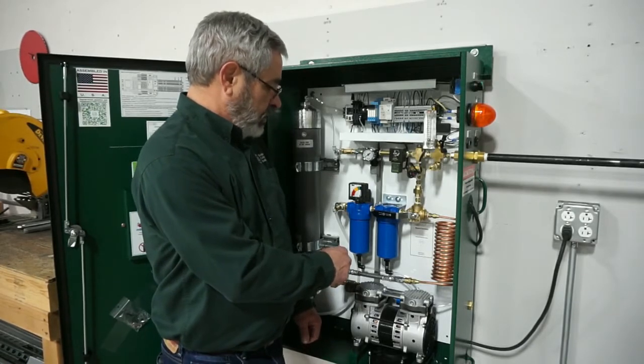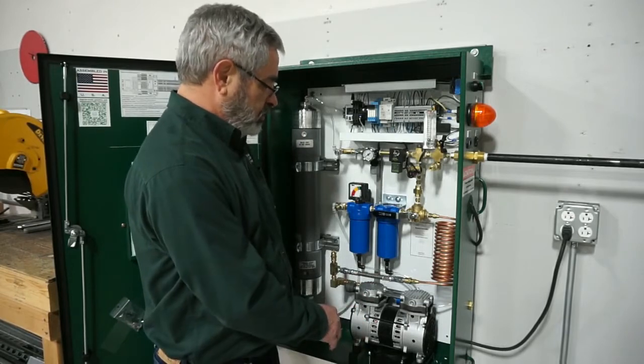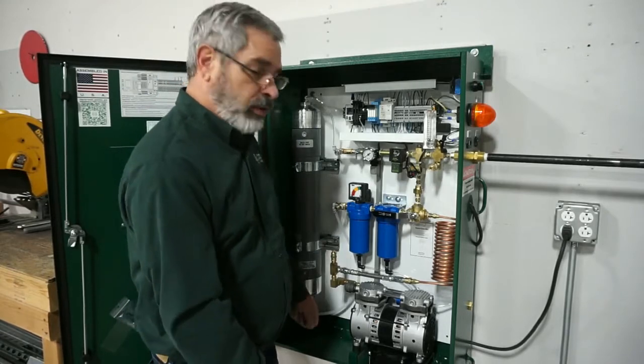Now the filter replacement process itself — once the generator is shut off, you want to make sure it's depressurized by pulling up on the ring of the pressure relief valve to make sure there's no pressure on.